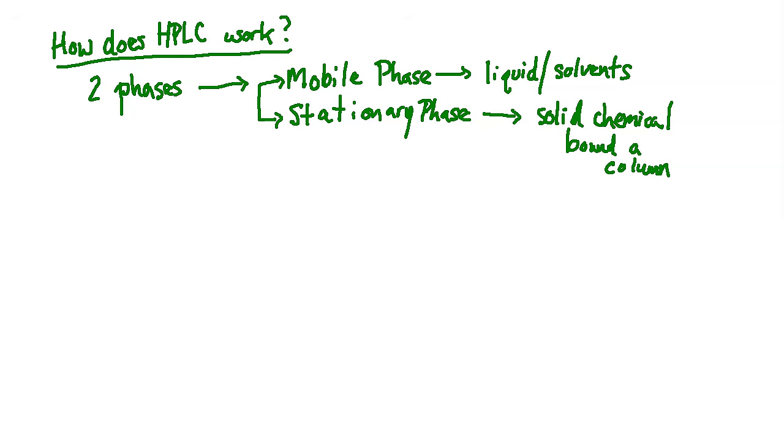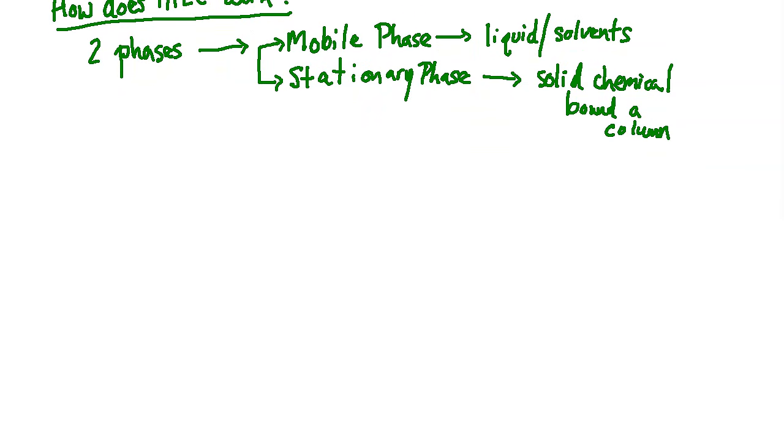And the goal with HPLC is you want to separate these materials out as best you can. You don't want them clustering together. Again, going back to something like a column that you would be running on a bench top in an organic synthesis type of manner, the goal is to separate the compounds out into different aliquots of solvent. You don't want to just bleed all of them down together, otherwise you haven't really done any type of chromatography and separation.